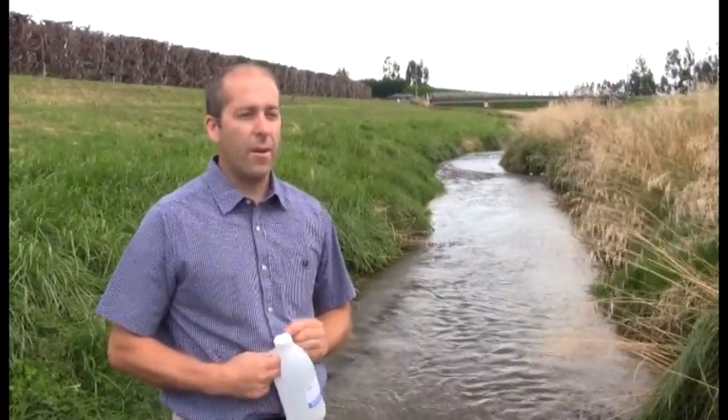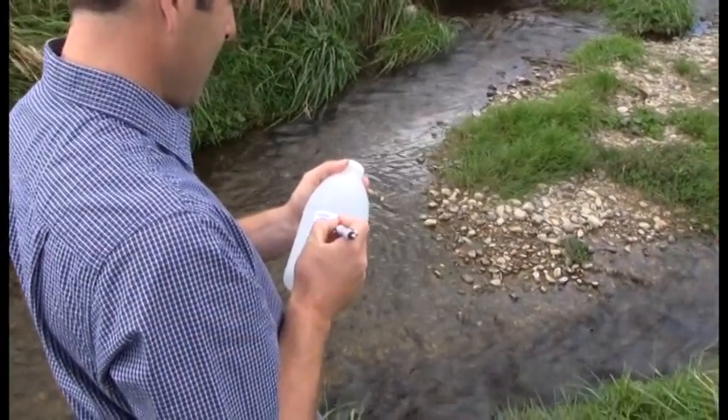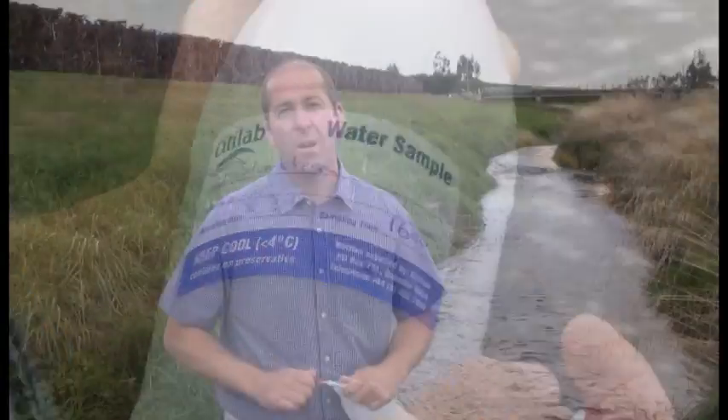With a good steady flow such as we've got below us here. The first thing we do before we take our samples is label the bottle with the site name, the date, and the time of sampling. On a notepad we can also note any other environmental conditions which might influence the sample, such as heavy rainfall or a dry period.